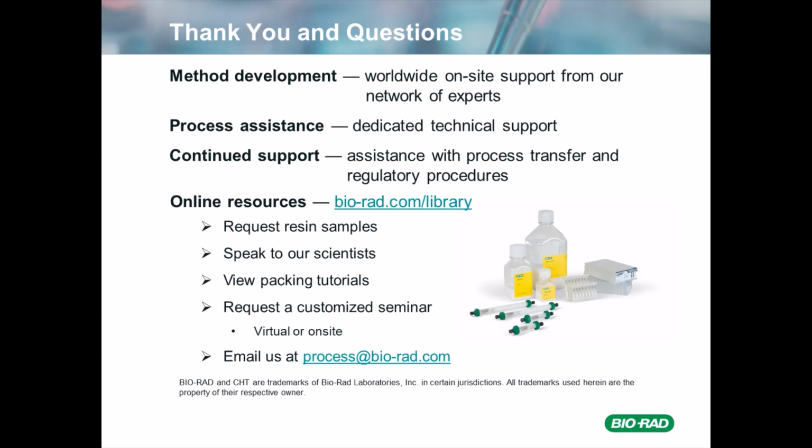Okay. I think we have time for just one more question. If we didn't get to your question, you can go ahead and continue to enter them, and Mark can follow up with you directly. So the last question is: you mentioned an artificial second peak when using sodium chloride as a test solute. Would such an artificial peak appear while using a sodium chloride gradient?